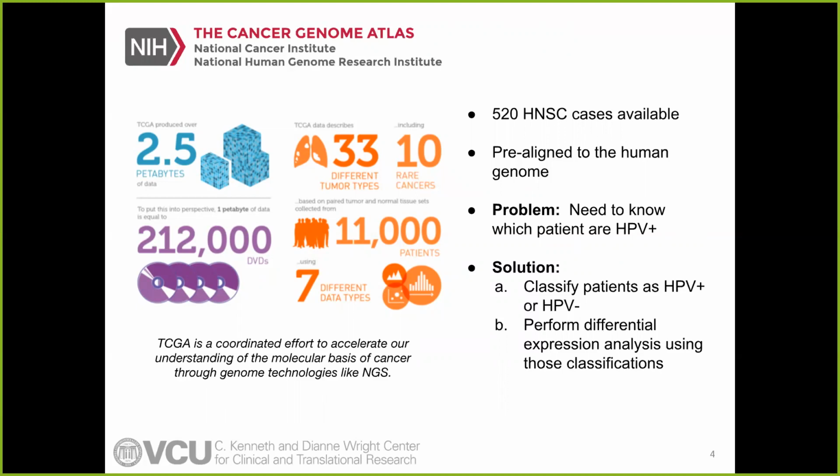And then each sample was run on a bunch of different modalities. So you have RNA-Seq, whole genome sequencing, microRNAs, protein abundance data. And so you're able to take all of these different platforms and for the same tumor and the same sample and compare.